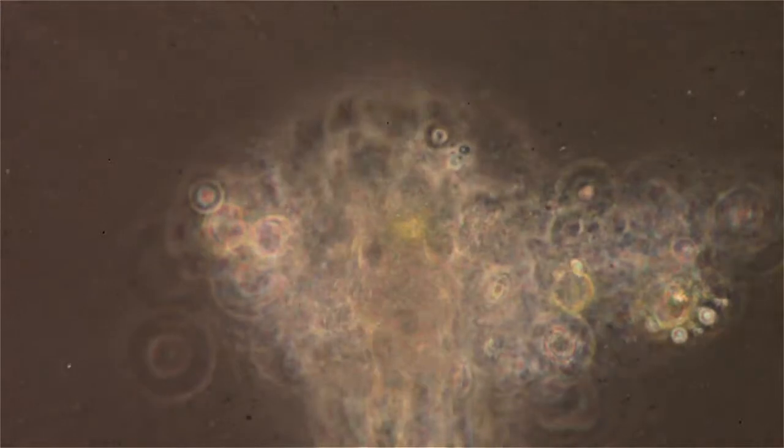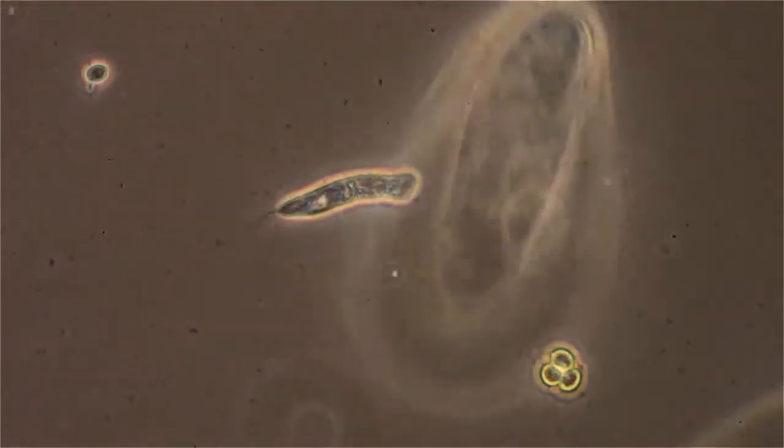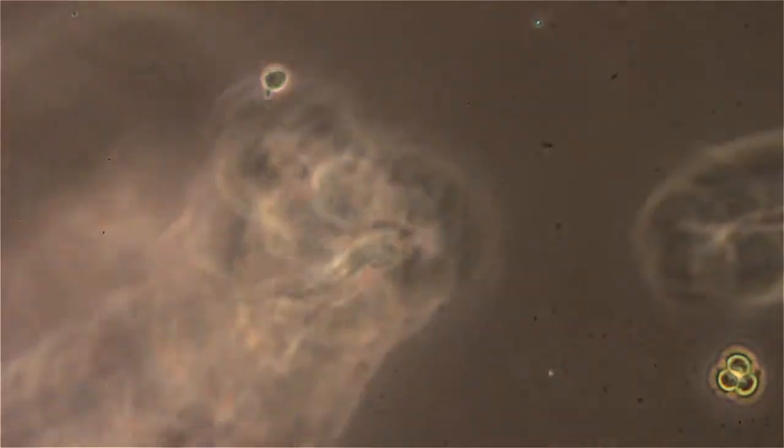The phase brings out all the little things you don't normally see in the water. Food for the rotifers and other large ciliates.